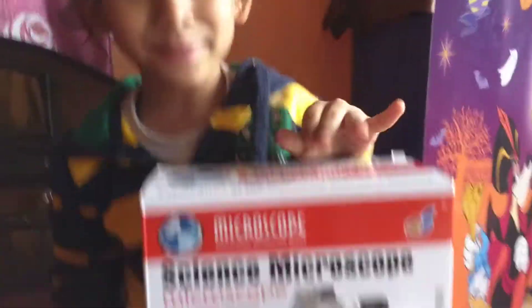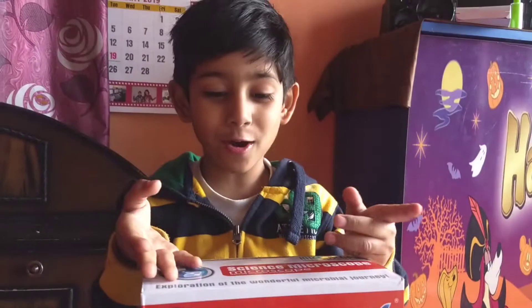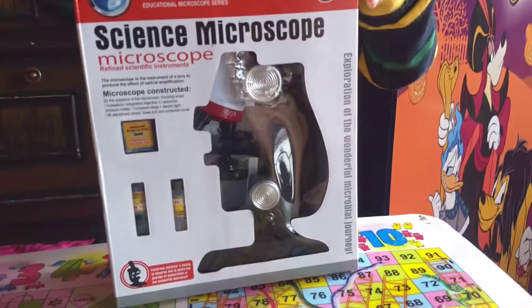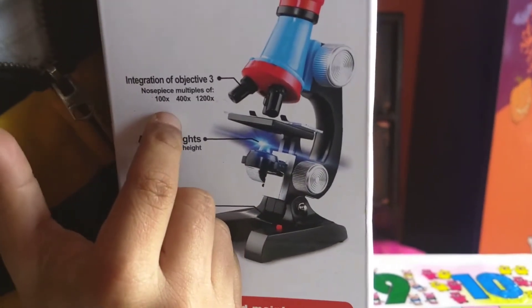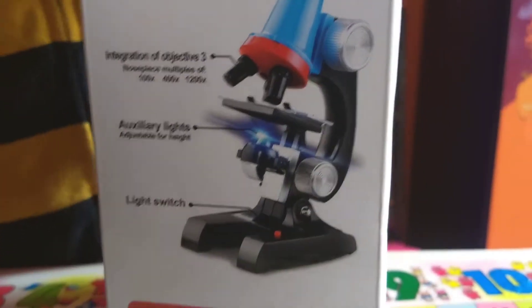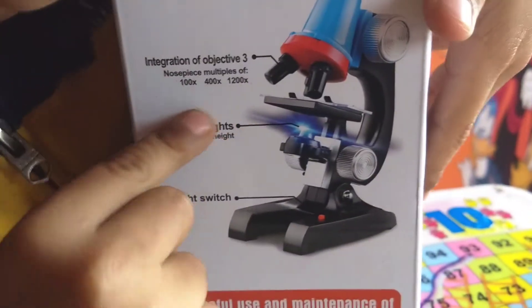This is my microscope. My father ordered it on Amazon and it came after two days. There are three lenses: one is the 100x, one is the 400x, and one is the 1200x. And it has an LED light too.